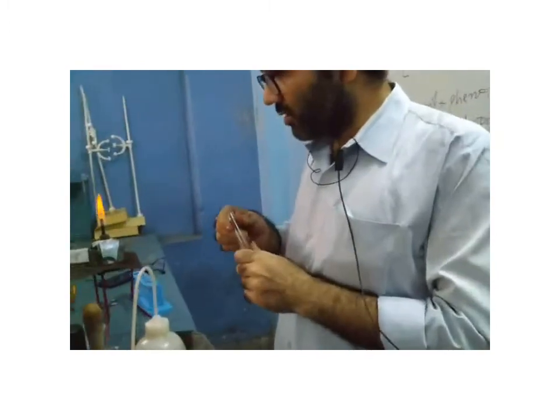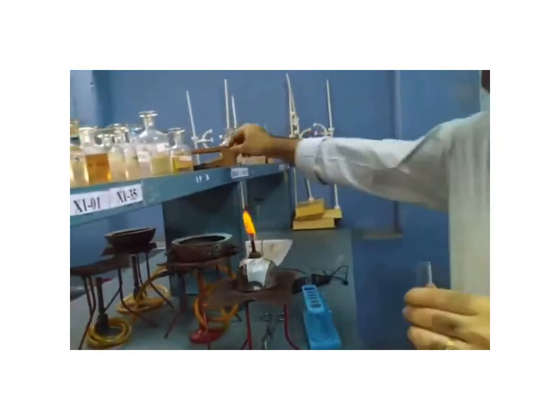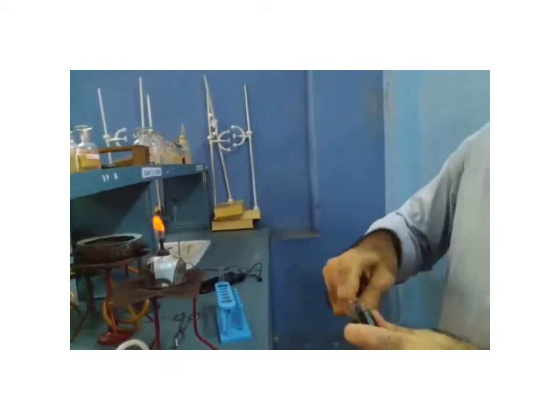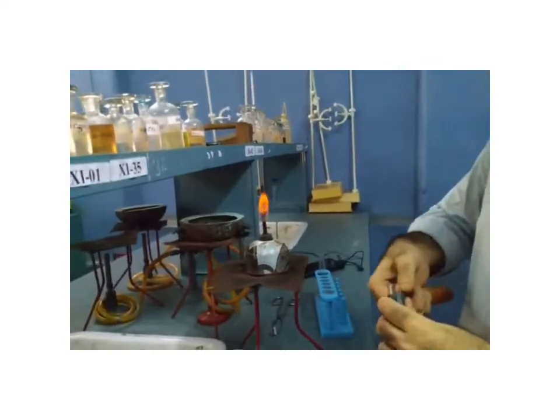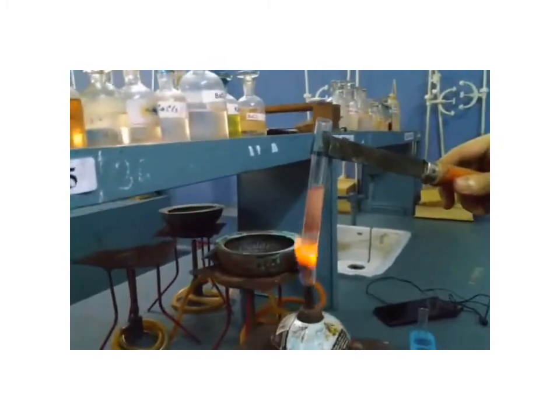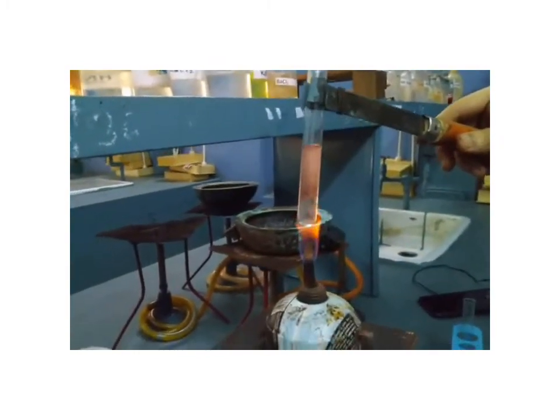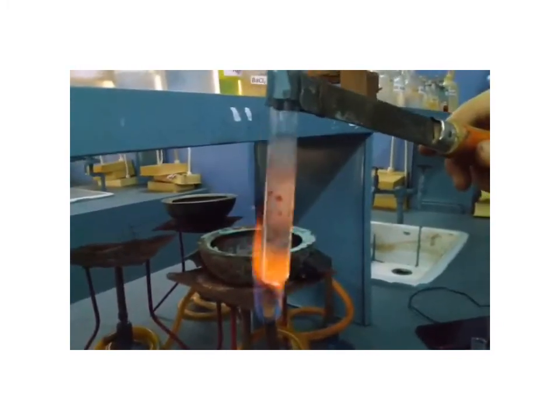observation will be that. Okay, let me take a holder. It will be better. If we take a holder, it will be better for us, definitely. For all heating purposes, it's better to do it with holders. So the conclusion is that the turbidity should disappear, so we should get a transparent solution.